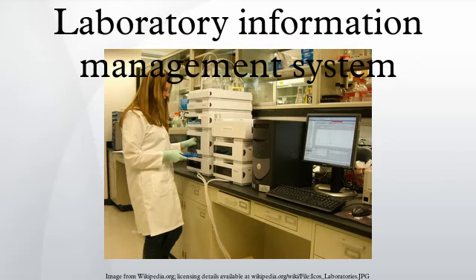Modern LIMS products now also allow for the import and management of raw assay data results. Modern targeted assays such as qPCR and deep sequencing can produce tens of thousands of data points per sample. Furthermore, in the case of drug and diagnostic development, as many as 12 or more assays may be run for each sample. In order to track this data, a LIMS solution needs to be adaptable to many different assay formats at both the data layer and import creation layer, while maintaining a high level of overall performance. Some LIMS products address this by simply attaching assay data as blobs to samples, but this limits the utility of that data in data mining and downstream analysis.